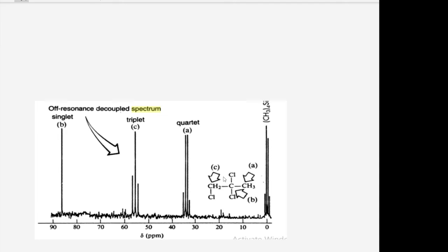Okay, in order to interpret it, first we have to write it in a simple way, like this: C H H Cl, CCl.